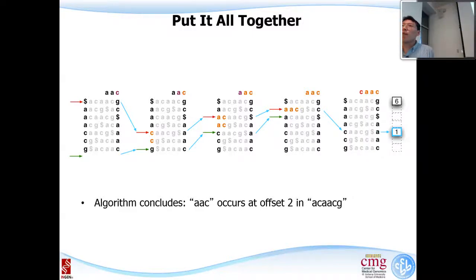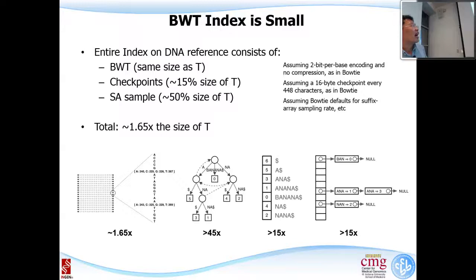If you do the other way, if you do this dictionary based, if you do 13 base or 14 base or 16 base, it's the full power of that number. Sometimes it can be way beyond that in memory usage. So that's the first feature. The size of the sequence is very nice. It's proportional to the reference genome size.